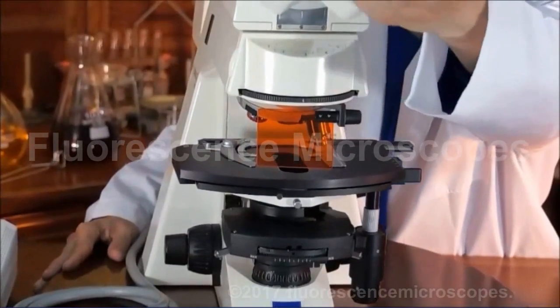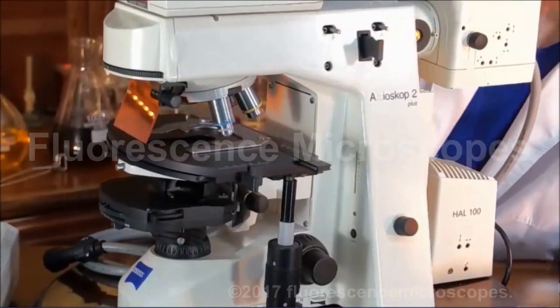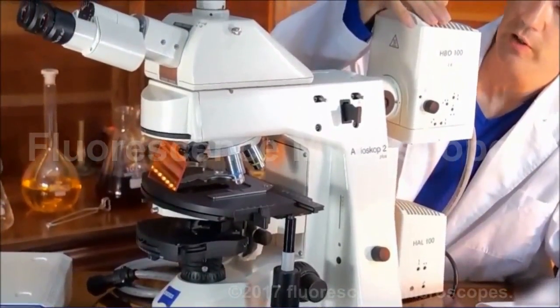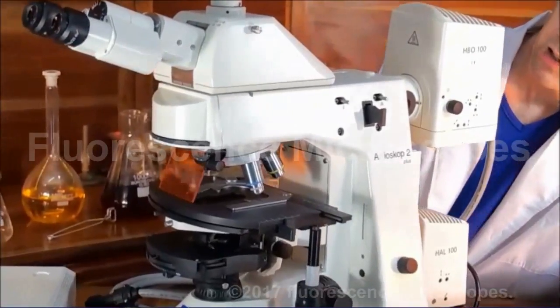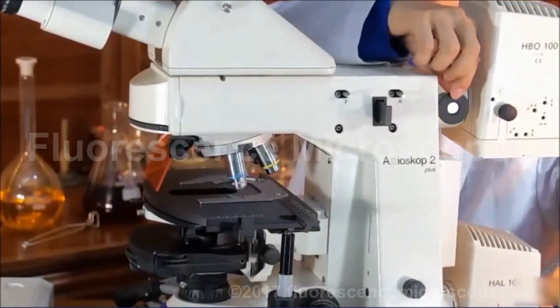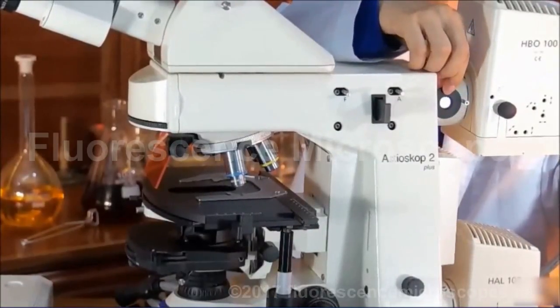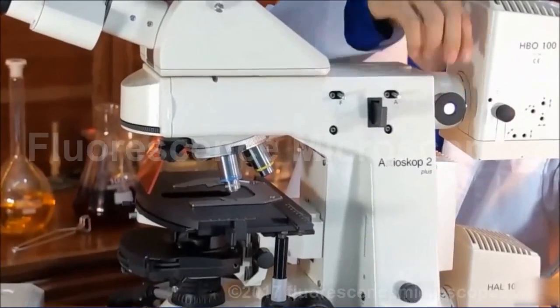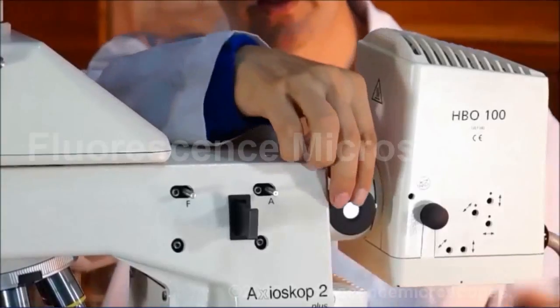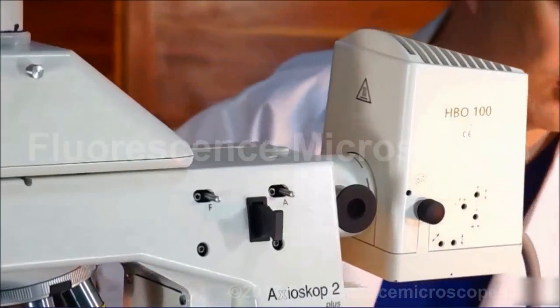Now let's take a look at the back. This upper unit is a 100 watt HBO Mercury. It has a Mercury bulb inside. And this unit does have a viewing aid on it. This is for centering your arc. When you pull it out, you can actually see the arc. There's a mirror where it goes to the side, and you can look in and see this arc.